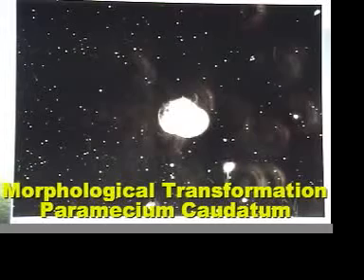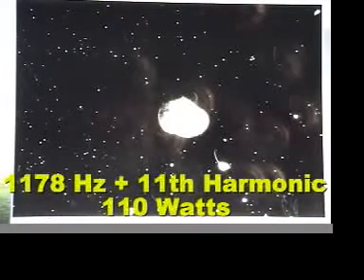Now we've gone up to 1178 hertz which has had its success in the past. Wonderful view of tiny organisms unaffected. You can actually see their single flagella in the dark field. Fantastic view. Power levels about 110 watts. SWR 1.15. 1178 hertz plus the 11th harmonic. And you see that little marvelous video because you can see those tiny organisms apparently unaffected. And you continue to see degradation on the upper right side. This was a Paramecium caudatum.